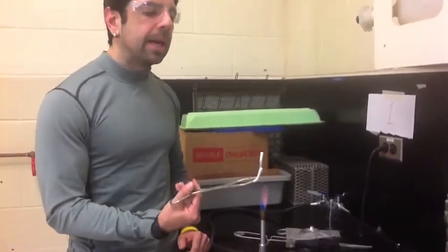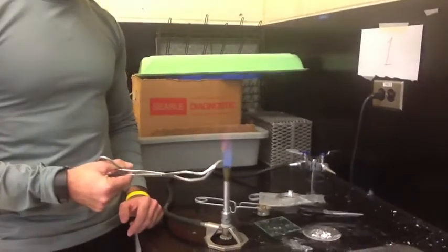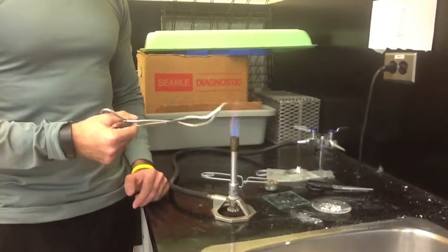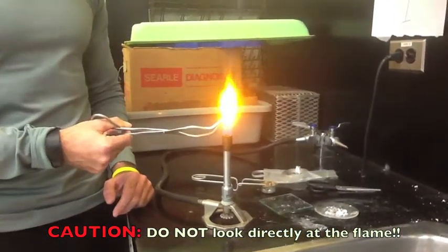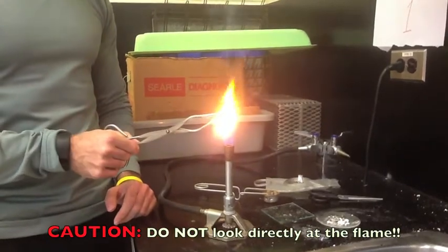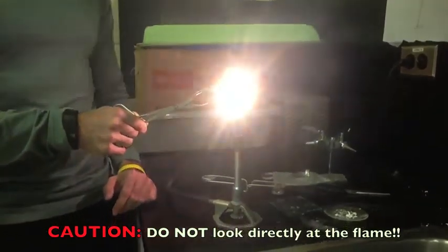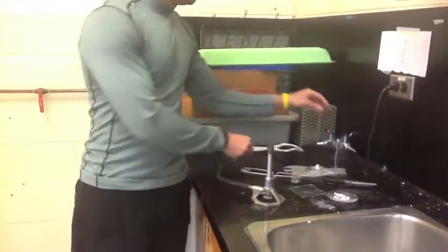So we have a silver metallic piece of magnesium metal, and we are going to burn it. Be careful, it gives off quite the light, so do not look directly at the flame. So here we go. Note the color of the magnesium. Once you are done, carefully discard it onto this little piece of glass. Then turn off the gas, make sure your area is tidied, and move on to the next station.